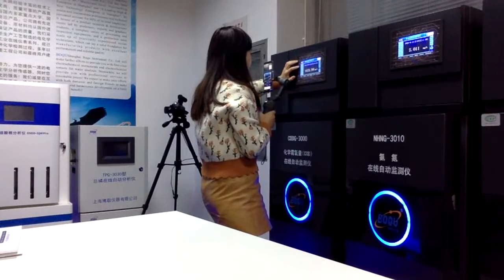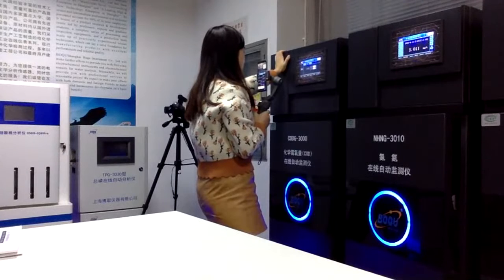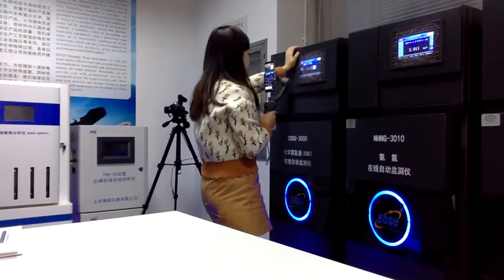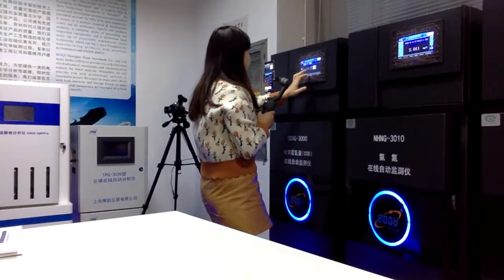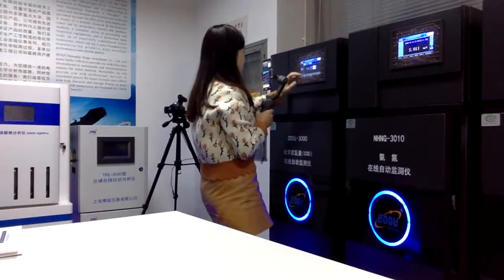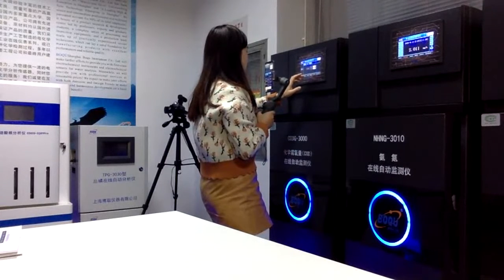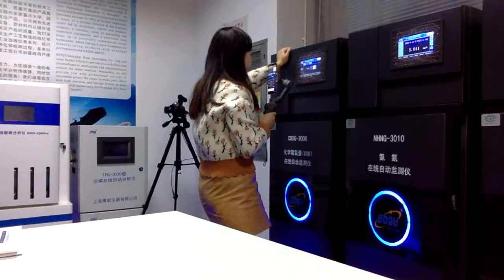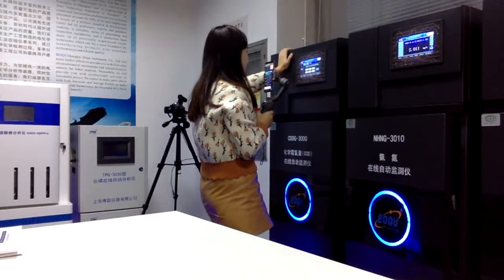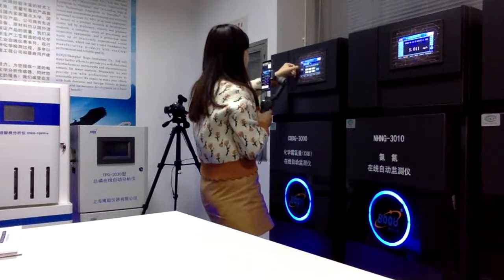And next to the daily operation, we have the parameters setting. So this is a simple page. It includes the temperature setting, so you can set the water sample temperature. Normally we just show about room temperature, like 30 centigrade, and also the water time, like 60 seconds. And we also have the time setting, so you can set today's time or the testing time through this page.